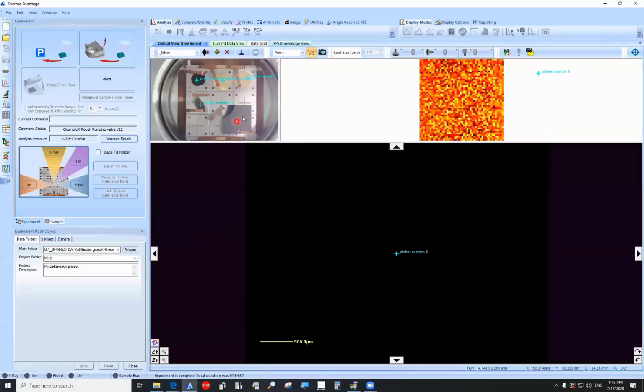And what you can see is that right now, we've defined from a different experiment a series of different positions on which we made some measurements. And then, Nishal, here's your sample hanging out right over here. I don't really know what this is in this spot right here. It almost looks like there's an interface that has formed between the two different portions of where we clamp this specimen. Is this contrast something that you're used to seeing on your specimens? No. Okay, well, that's very interesting. So we'll have to go see what that all means.